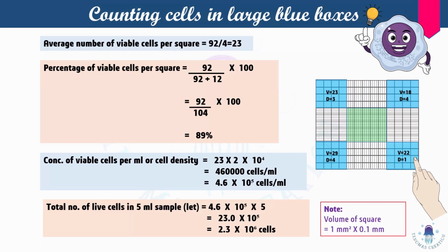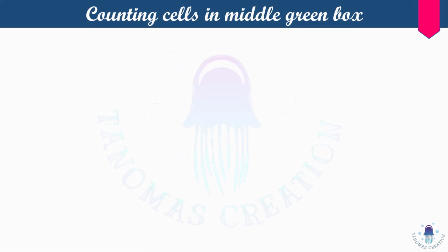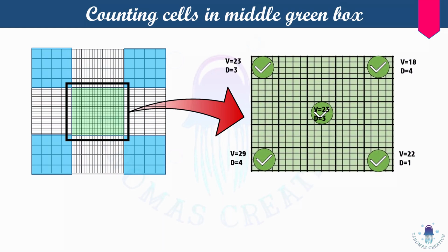Now you have to note that the volume of a square is surface area into depth, which is 1 mm square into 0.1 mm. Okay. Now coming to the middle green boxes. Suppose we have to count the cells in the middle green box. This one. Okay, this is the enlarged view. Suppose we have this much of viable and dead cells available in this green box.